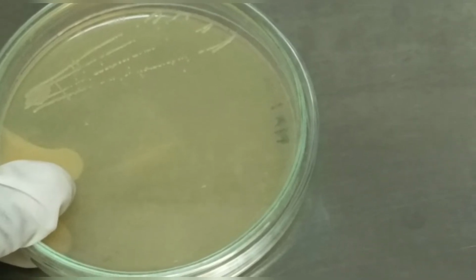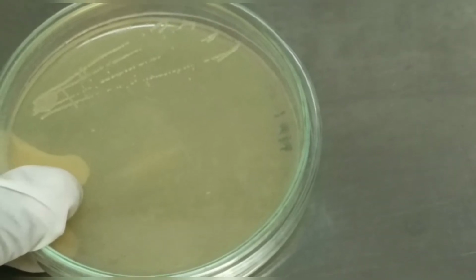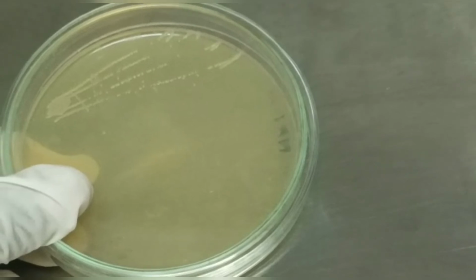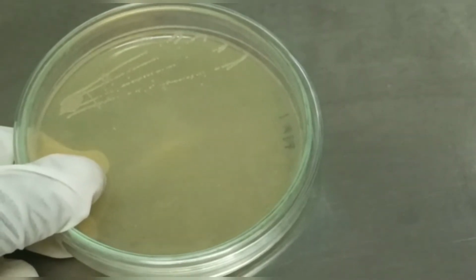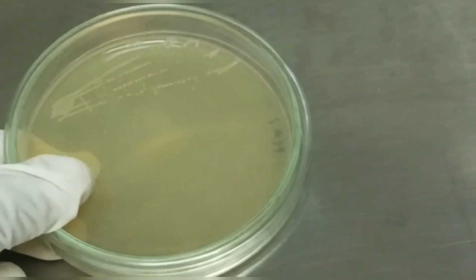Microorganisms are everywhere, and to study specific organisms, it's essential to grow them in a strictly controlled lab environment. A complete sterile condition protects the pure microbial culture from contamination by other organisms entering through the air, water, or other unsterile sources.